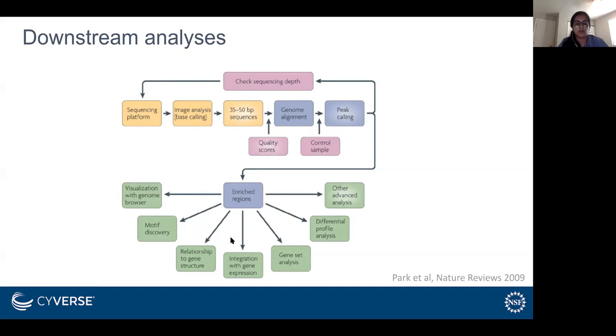If you also have expression data for your experiment, that's useful to answer which of the regulated genes in your expression data are likely to be direct targets of the transcription factor, and whether the transcription factor is an activator or a repressor.